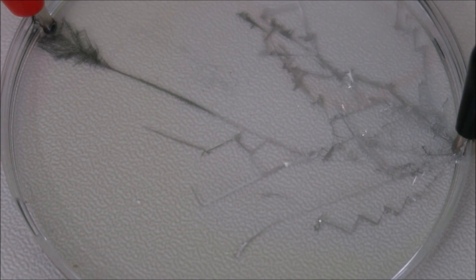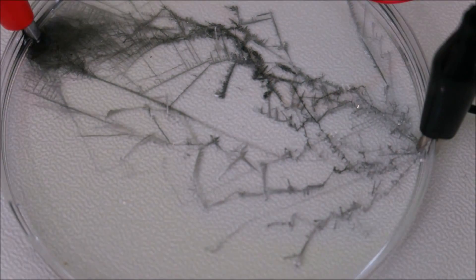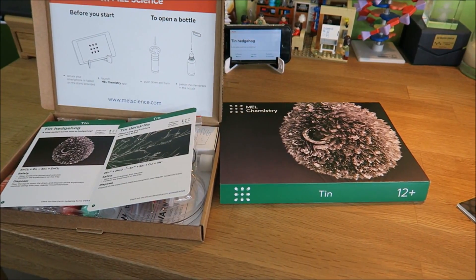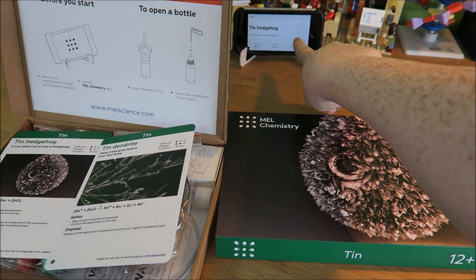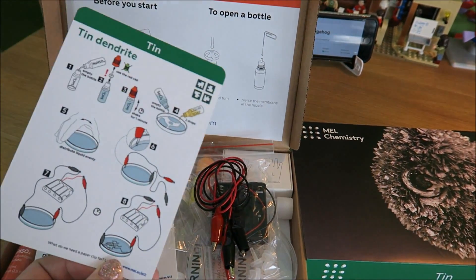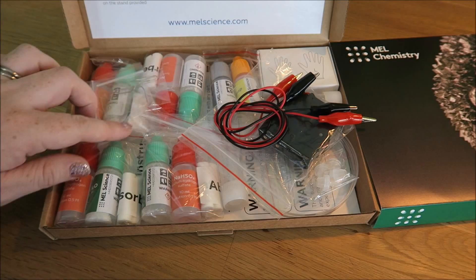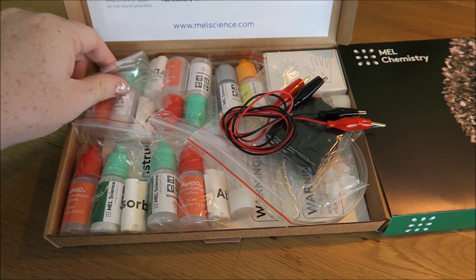Now I'm going to have a go at the experiment. We are starting off with the tin chemistry one. You see the pretty box, the iPhone stand with the app open so you can see what to do. Here is the box with our nice little instructions and all the bits you get inside. We have little packets — that's everything you need for one experiment.